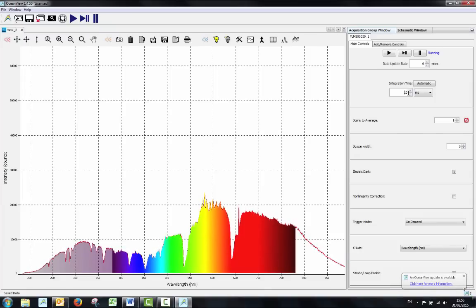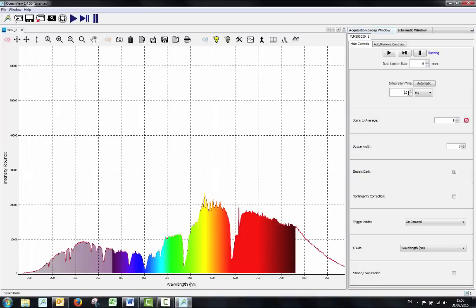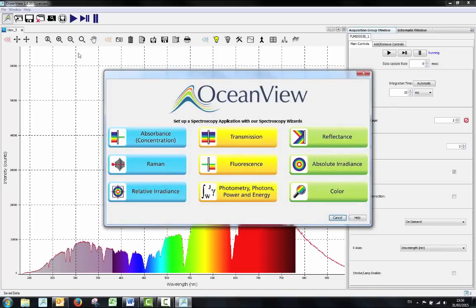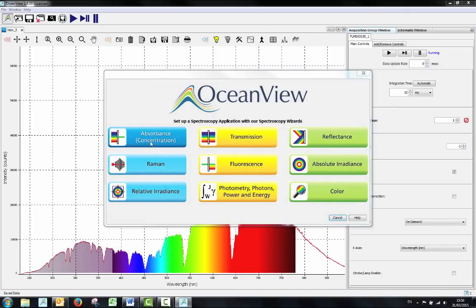An absorbance measurement can be done in OceanView by using the Create New Spectroscopy Application Wizard which can be found in the top left corner. Select this and then choose absorbance from the menu.